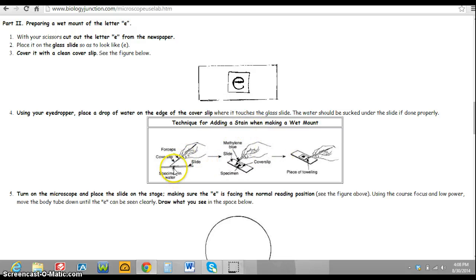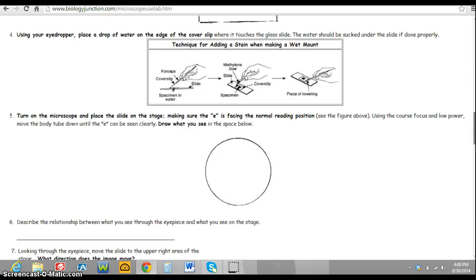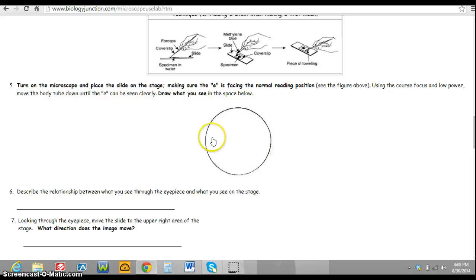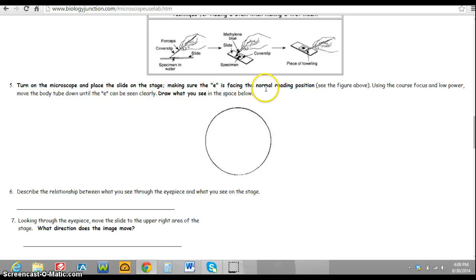That shows yourself that you know how to put the specimen, in this case the letter E, and a cover slip on a slide. Next thing you'll need to do is turn the microscope on and put the slide on the stage, making sure that it's in the normal reading position.